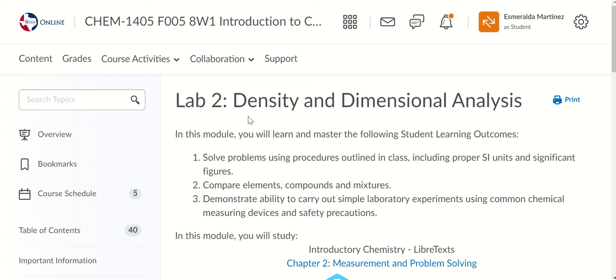Hi everyone. So in this video, I'll be outlining some main things from Lab 2, things to watch out for, and giving you a short overview on how to use the Chem Collective Virtual Lab. This lab is where you'll first use Chem Collective. You will use it down the line in a few of the rest of your labs, okay? So you will visit this again and it will be useful, I promise.